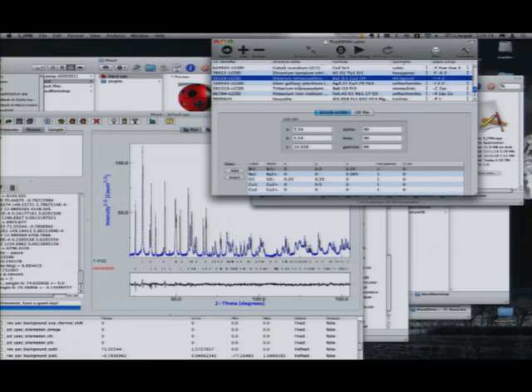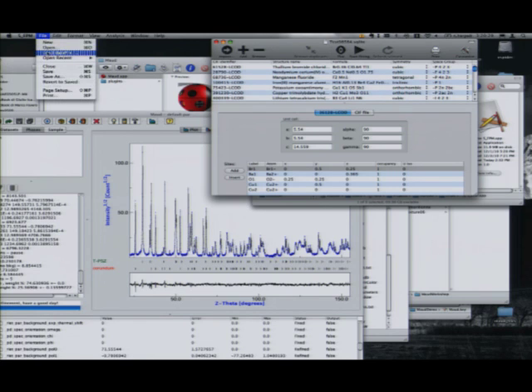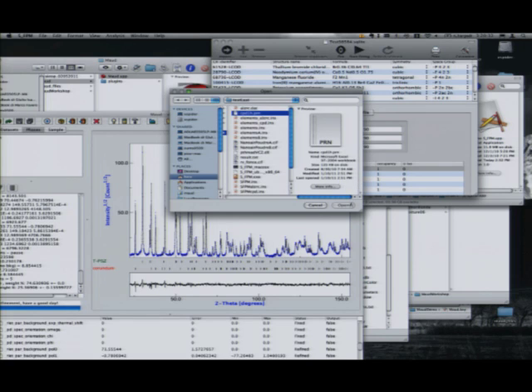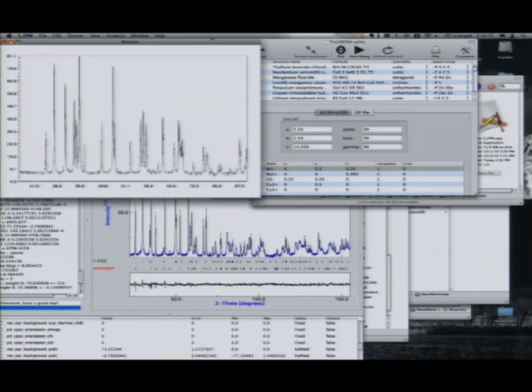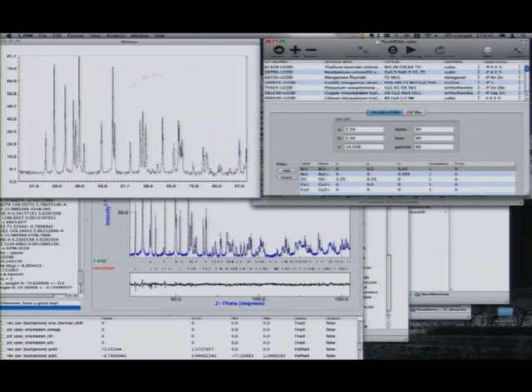So why I have this big database, okay? Because then what I want to do is I load a data file, let's see. For example, this one is from the CPD, the same, I think, as was shown by Jan Madsen yesterday. And then what I want to do is just say, go with the analysis, so find out what phases you have and the quantitative phase analysis.